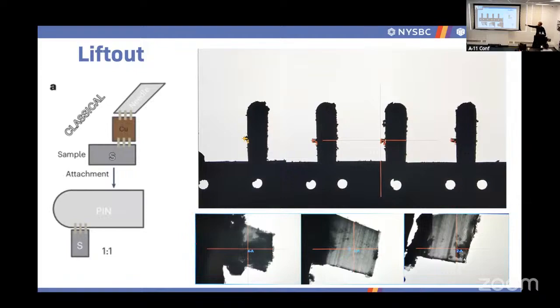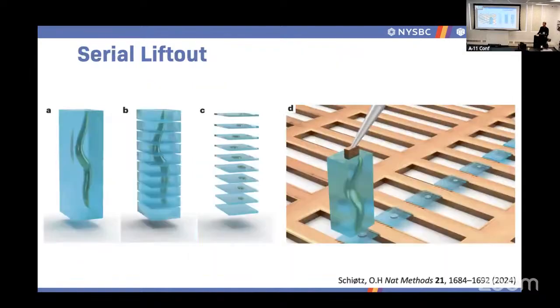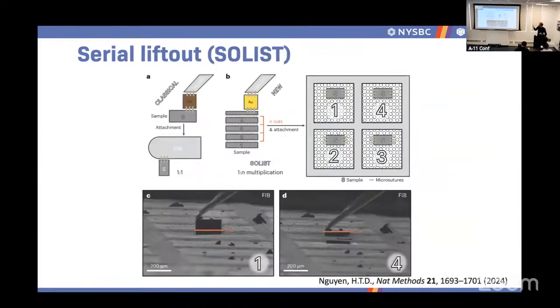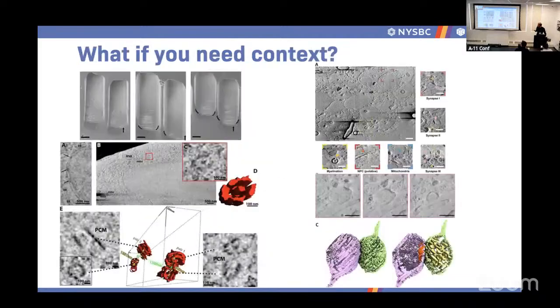It contaminates like hell. These posts here look like junk at the end of your transfers most of the time. So the guys in Martin's lab came up with an idea. We should be using regular grids, and we could also deposit multiple slices throughout. It turns out to be easier than a regular lift out, so it was a very good idea for many reasons. Somebody else from the same lab thought maybe we should deposit it on carbon. Excellent idea as well, because it makes things even easier, although you're wasting more sample.